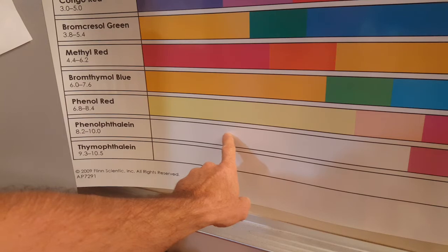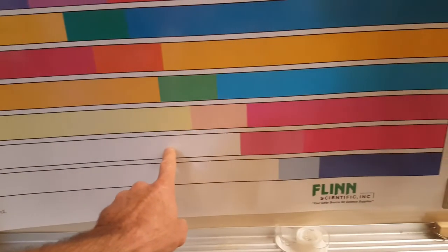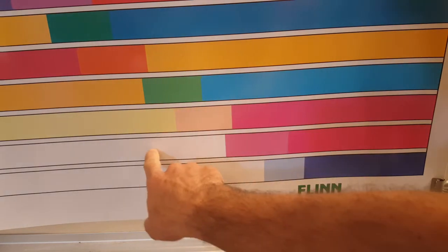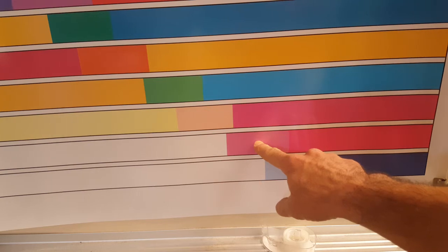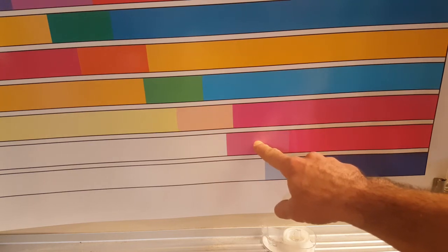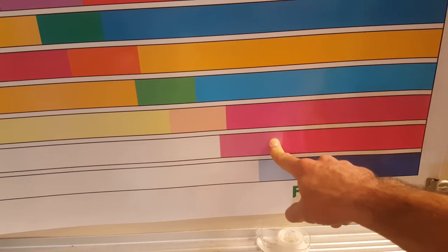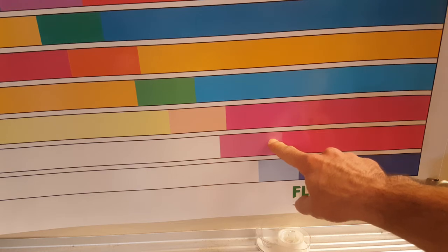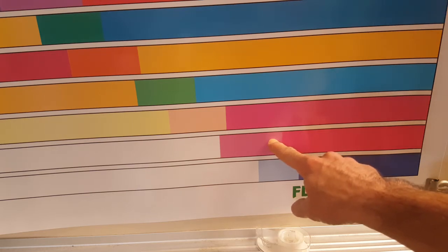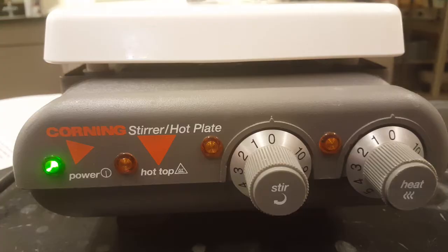As we add the base to it, it goes up slowly, slowly, and then very rapidly, when we hit equivalency, it just jumps with 1 single drop into this base region, and the pH indicator changes chemically and starts emitting a different spectrum of color. So we see it turn pink. That's when you stop. I'll show you how to do it.